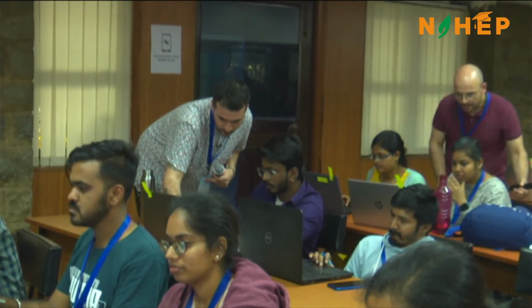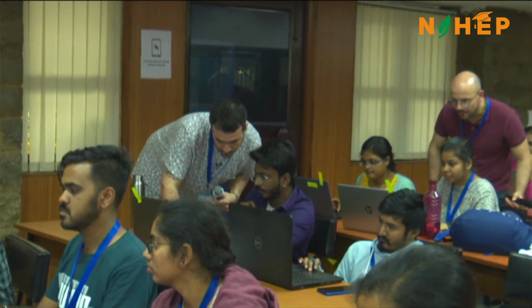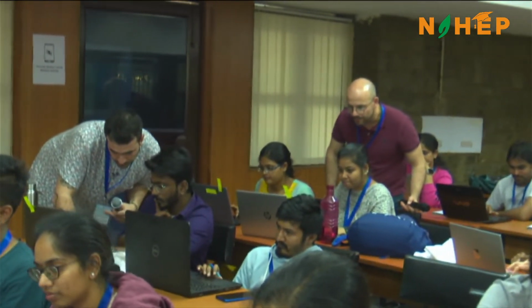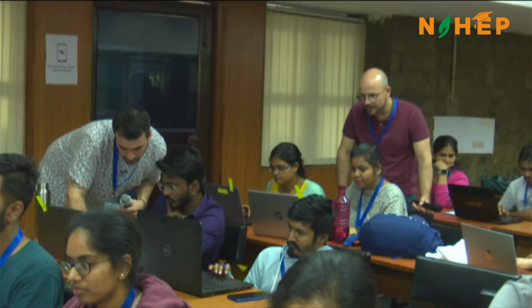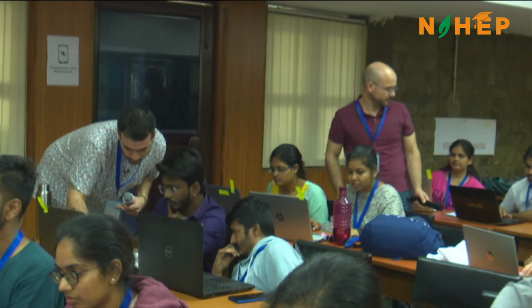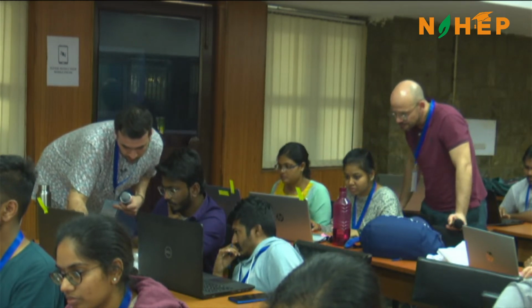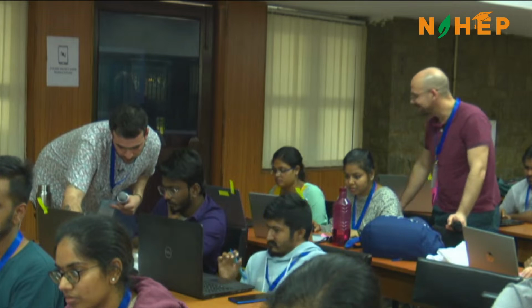Are you there? Okay. Yeah, now try to run the code. Try to run the code. Error, the libraries are loaded. Object plot not found. So now you need to run the code at line 181. Okay. Yes. Function not found.